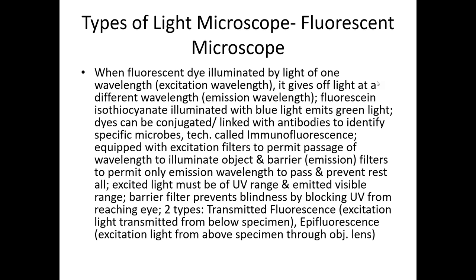Illumination means all light will illuminate the object. No. What is the phenomenon of fluorescence? Anybody? Yeah, absorbs light at a particular wavelength and emits light at a different wavelength. Very good, Shalini. That is what fluorescence is. It absorbs light at a particular wavelength and emits light at a very different wavelength. Good answer. So we will go to fluorescence microscope now.